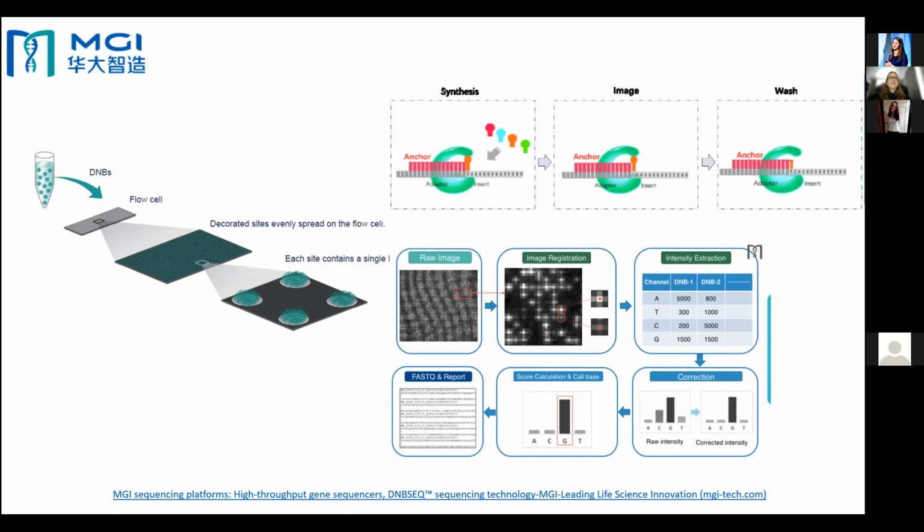After that, the sequencing can start, and it's basically sequencing by synthesis. Again, it's the same 3 phases: incorporation phase, imaging phase, and cleavage phase. Similarly to Illumina sequencing, in the incorporation phase a complementary nucleotide attaches to the template. In the imaging phase, the optical system detects the light emission of the fluorophore, and in the cleavage phase, the block is removed, the fluorophore is cleaved off, and the next nucleotide can be incorporated.